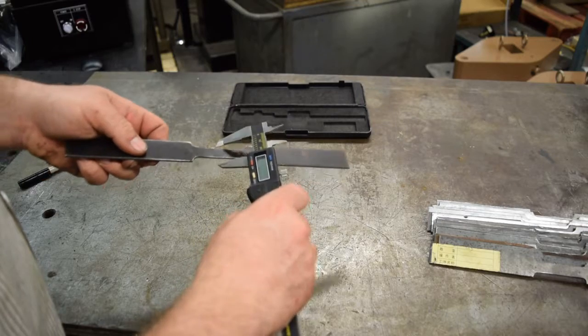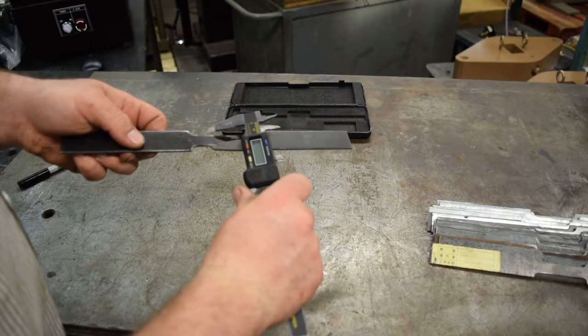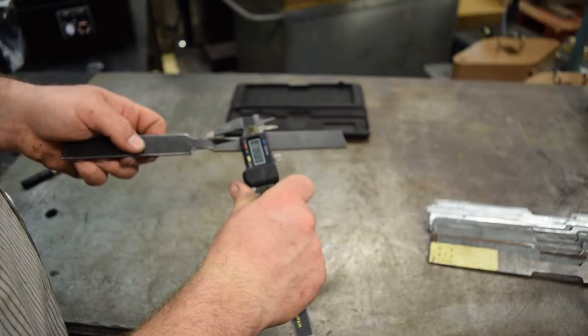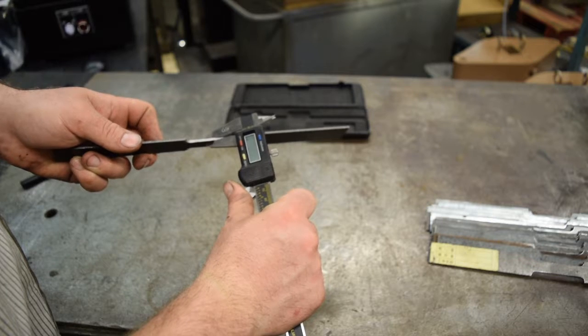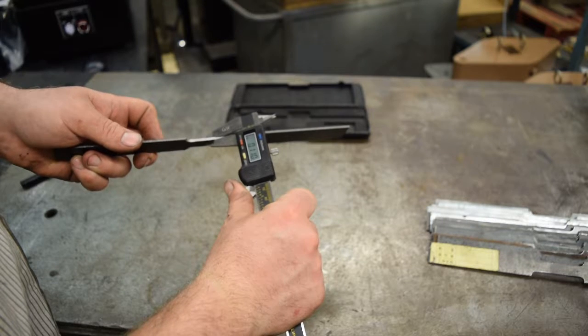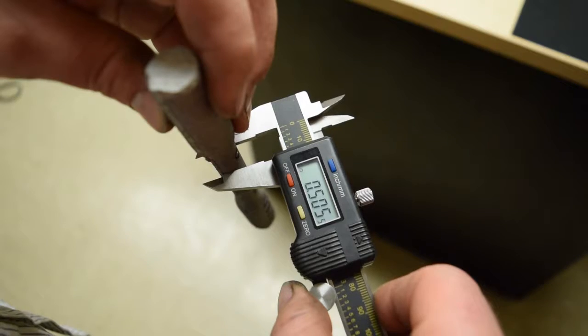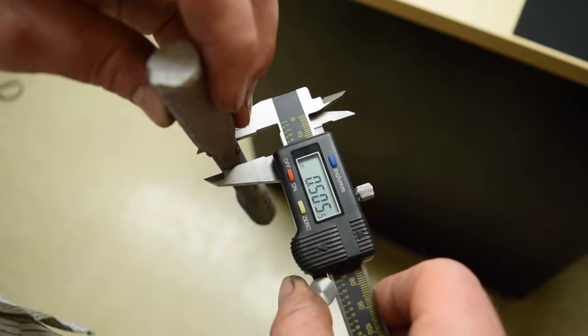you will need to measure the sample. For flat specimens, you need to measure the width and thickness. For round samples, you need to measure the diameter.